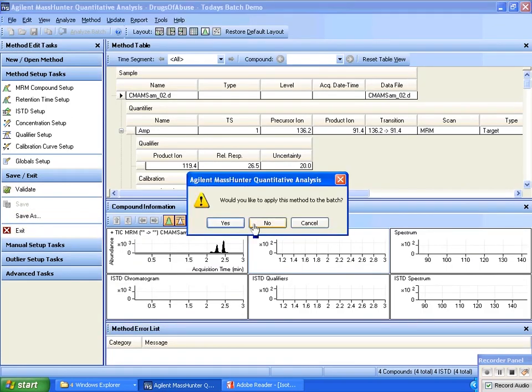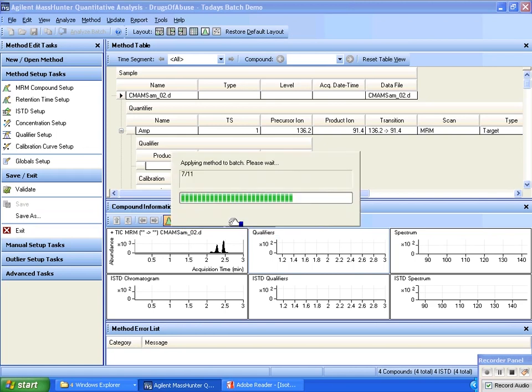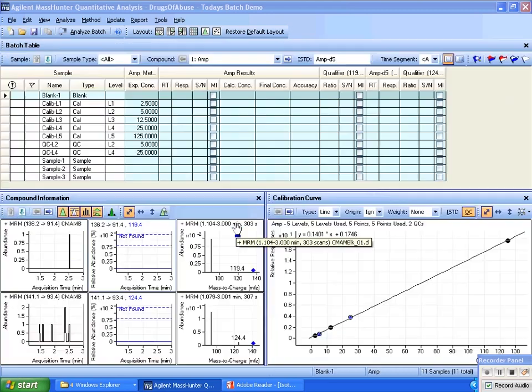So that is a mechanism for you to manage your method, not through a file, but manage that method by propagating it every day to the next batch.